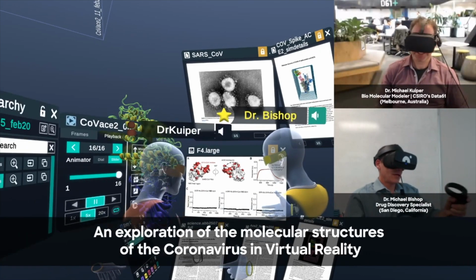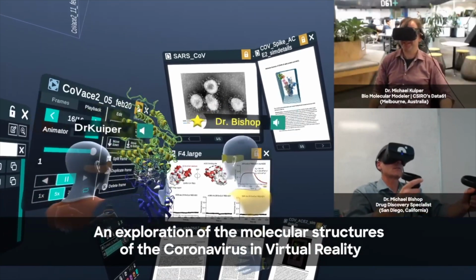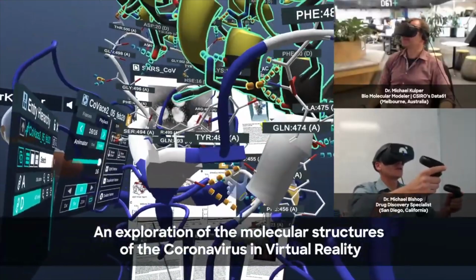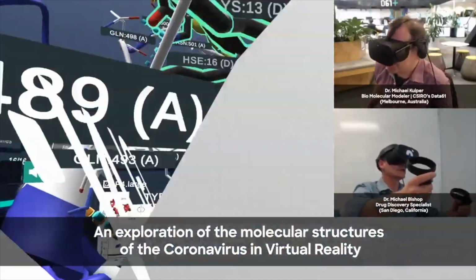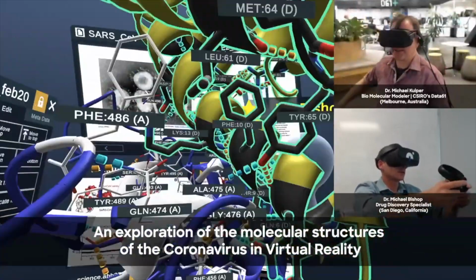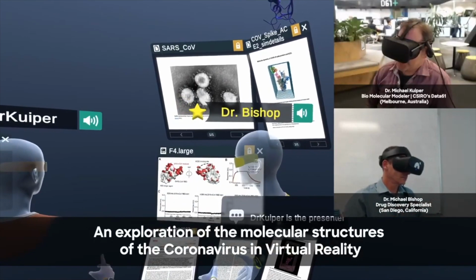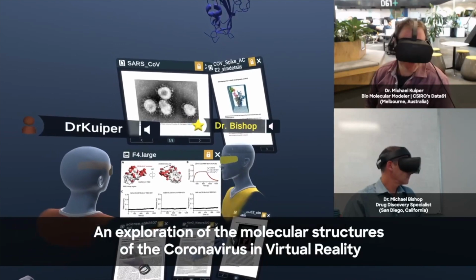I just really wanted to get in with my own hands and get up close and look at some of these interactions at the interface. There's this histidine here that really seems to be right in the middle of a few different hydrogen bond donors and acceptors. So you can imagine that this is a key region in the middle of the interaction. Really, really nice. This is the powerful thing. We'll be sharing, of course, all this data, so people can take a look at these structures for themselves.